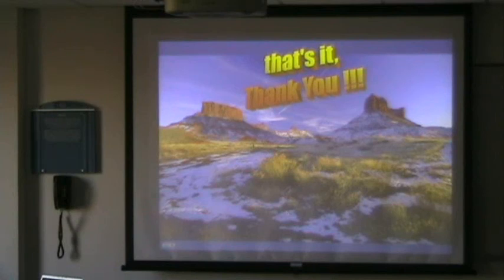So we do what is called dual-axis tomography. So you take one and then you rotate the grid and you take another one. And that's typically about 300 images. Wait, so you do a series of tilts like this and then a series of tilts like this, not all angles in between? No. So what you have is a missing pyramid instead of a missing cone, which is not so dramatically different actually. The missing wedge, if you only do one axis, you have a missing wedge, okay?